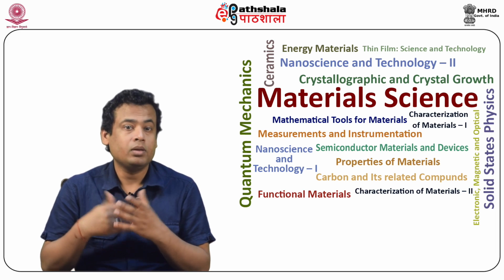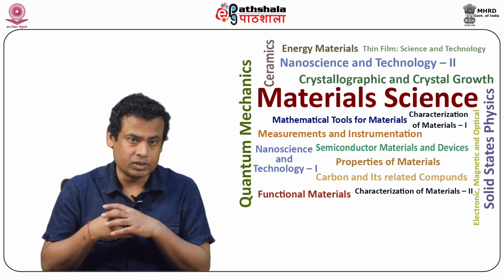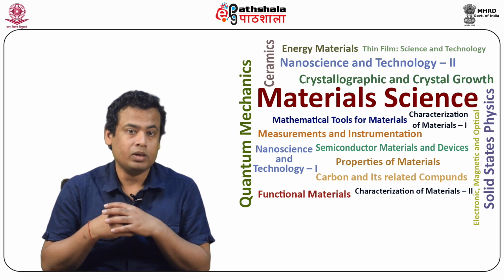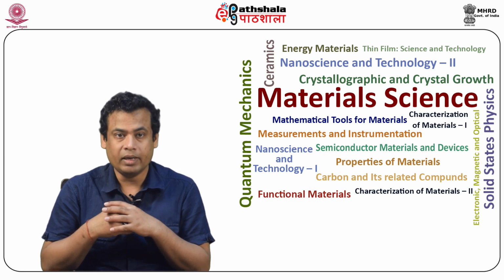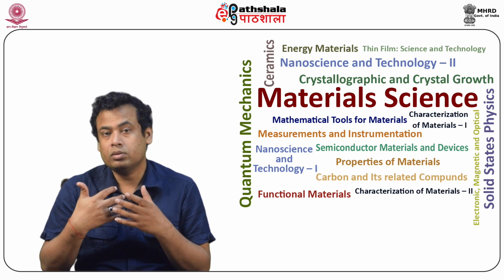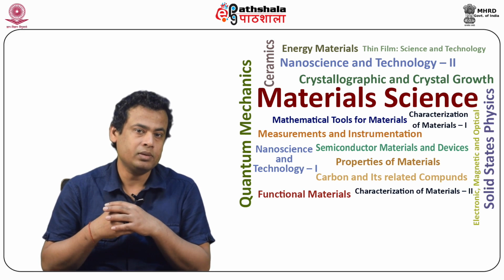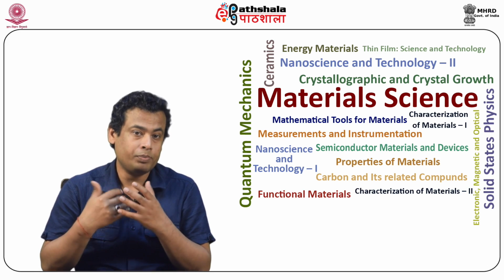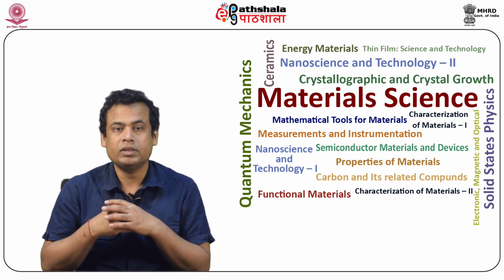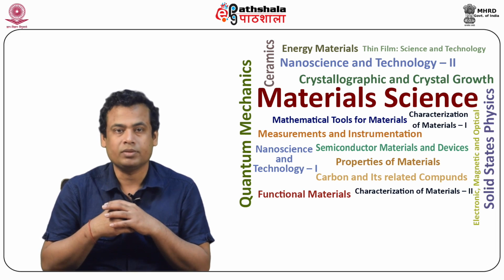The mean free path is related to the scattering cross section by lambda MFP equal to 1 divided by Qt. For the probability of scattering in a specimen of thickness t, the probability P can be written as t divided by lambda, which is equal to Qt times t.